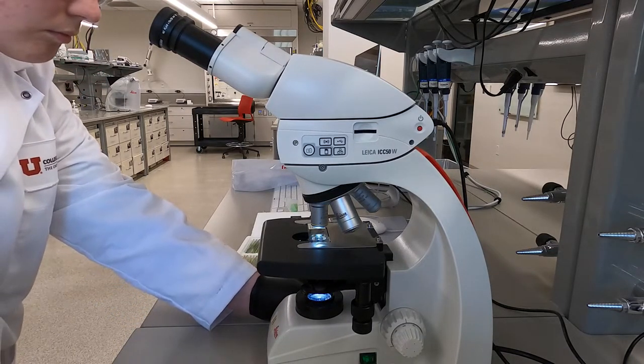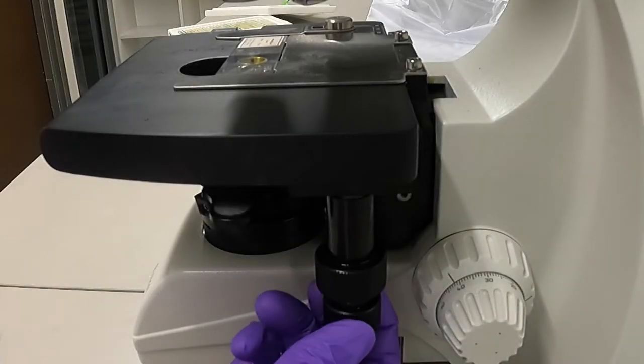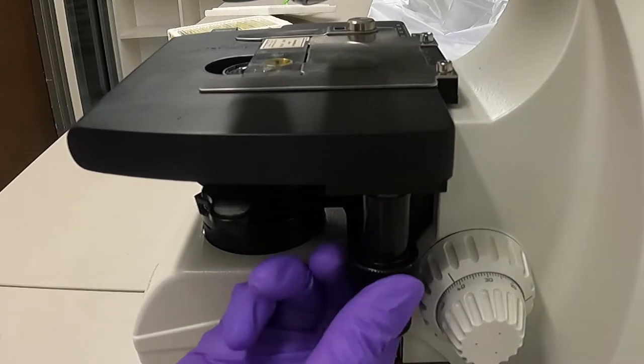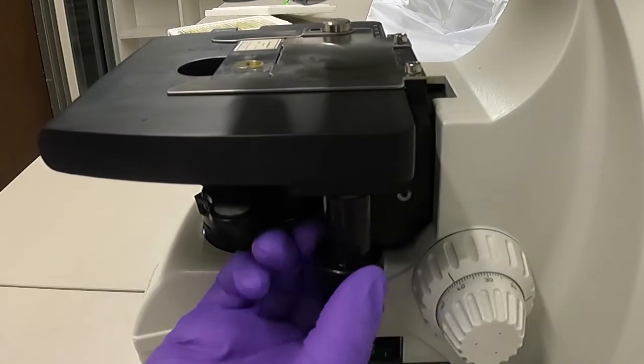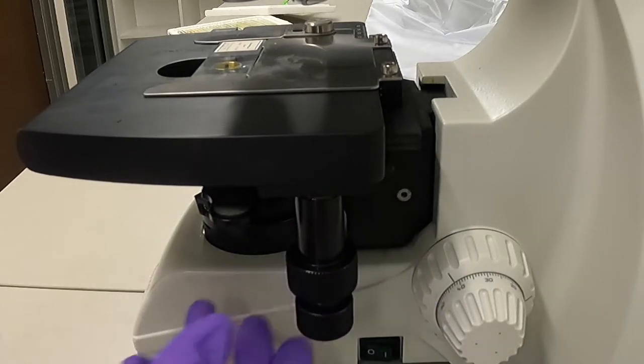Now that the sample is in view, we can start adjusting other parameters such as centering, the level of illumination, and fine focusing. If there is a specific part of your sample that you are trying to look at, the slide will need to be moved so that the distinct feature is in the center when viewed through the eyepiece. To do this, use the stage controls to make fine adjustment to the slide's position.